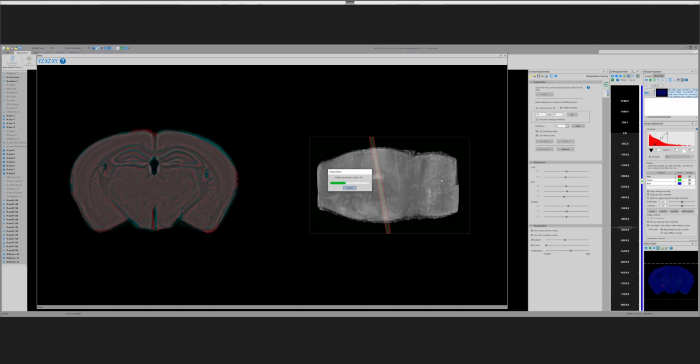Chip, toward that, can I ask, per day or per week, what is your workflow in your particular lab for how many brains you can get through at this resolution and this rostral caudal extent? Going through this part, the cell detection can take an hour to 2 hours. Again, it's automatic. We'll do a webinar on that.